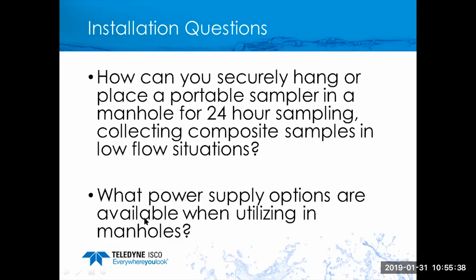Now, for longer term needs where it's not possible to have as many folks come in, that's where probably a deep cycle marine battery and even a solar panel charging system could be used to get greater continuous power in a remote location. We're starting to get close to the end of our time here, so I'm going to close things out with a couple of 2 or 3 final questions.